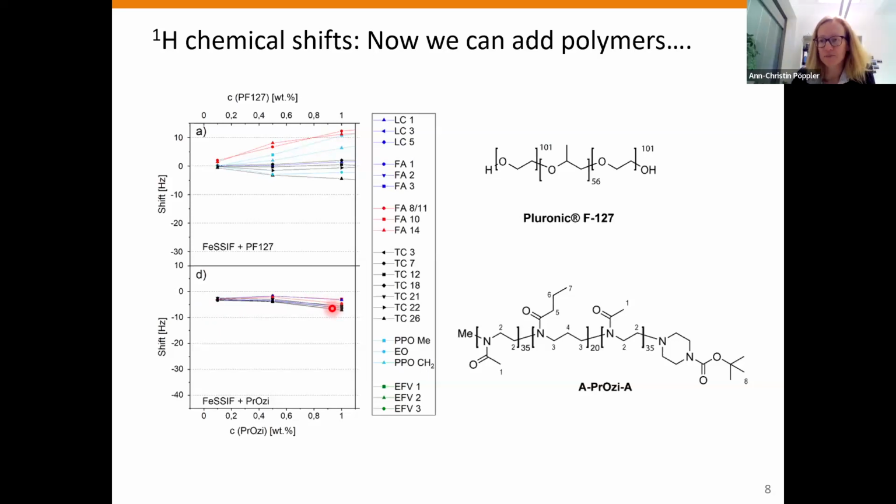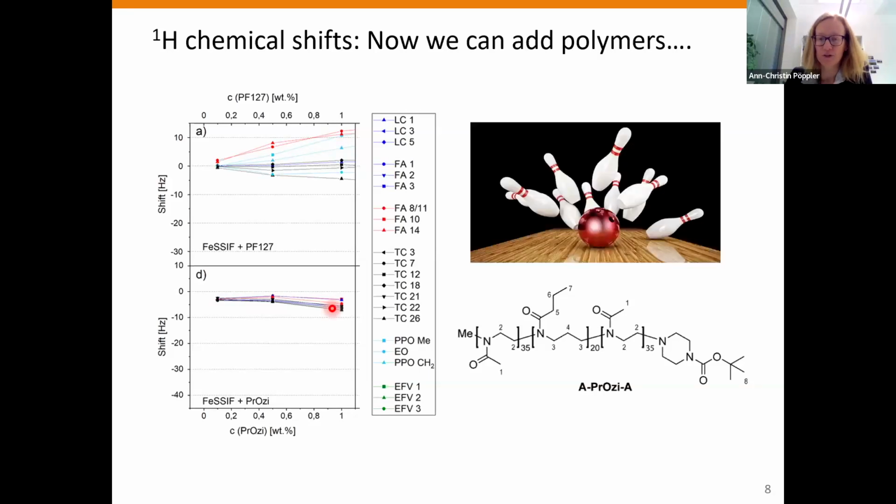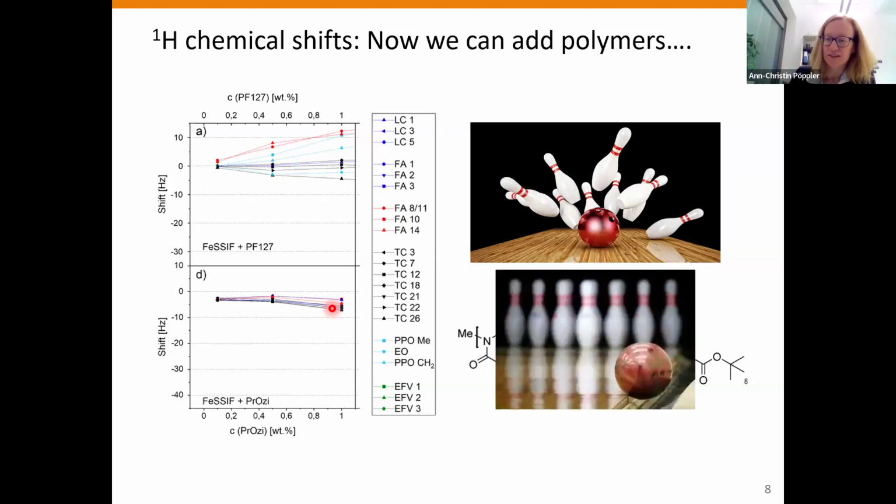And this might be a first indication, a hypothesis, saying, okay, the first one is introduced into the colloidal party or self-assembled party, while the second one is like bystanding and is not massively influencing the composition and the colloids that are forming.